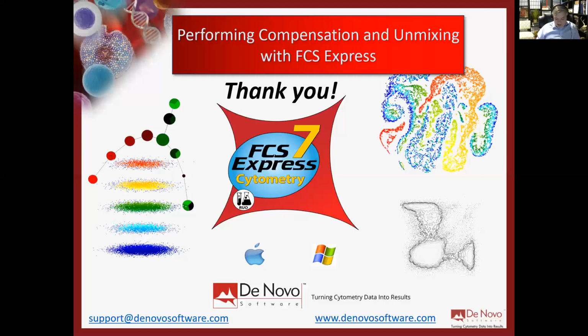So again, thanks so much, Kathy, for putting together some of those rules to go over. I always like to take the opportunity to reiterate it, because it's one of those things I see when I go all over the place. Yeah, absolutely. And we want to be part of the good fight for rigor and reproducibility in data, with flow included in that. And that's a big part of it.